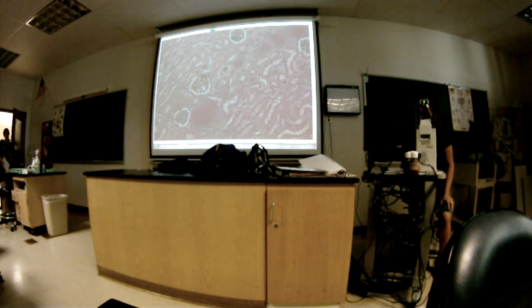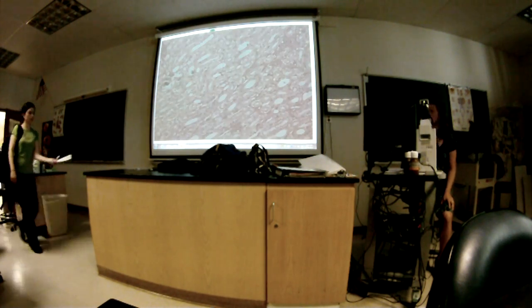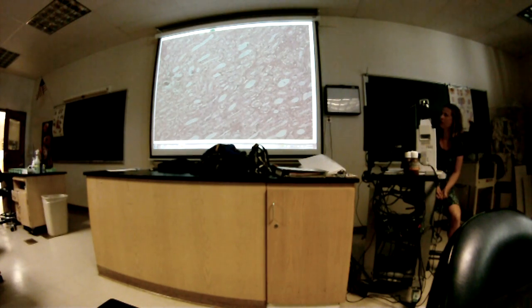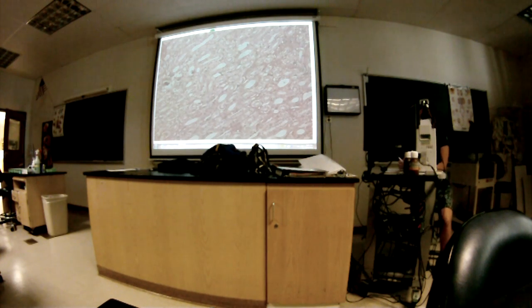All right, question 3. Come on in. Question 3 is we're looking at a particular region of this organ. What is this region called? Kind of a close-up here. I can back up in a minute. What is this region of this organ?